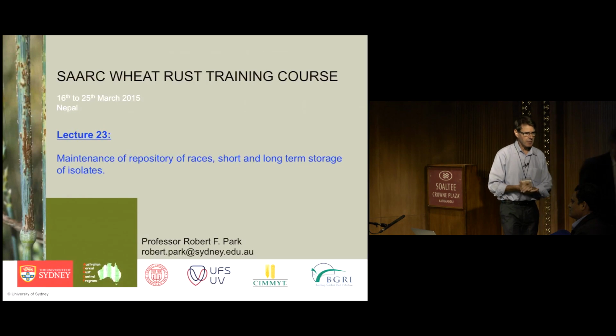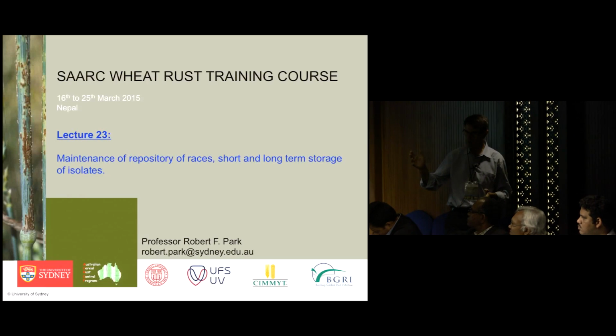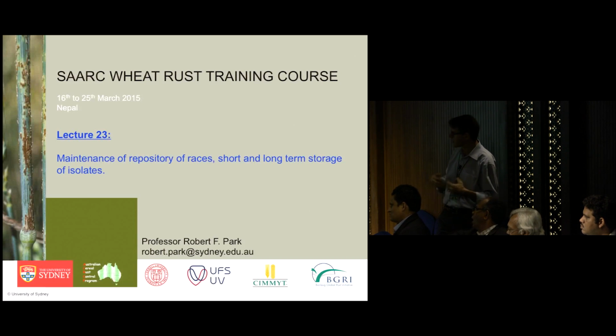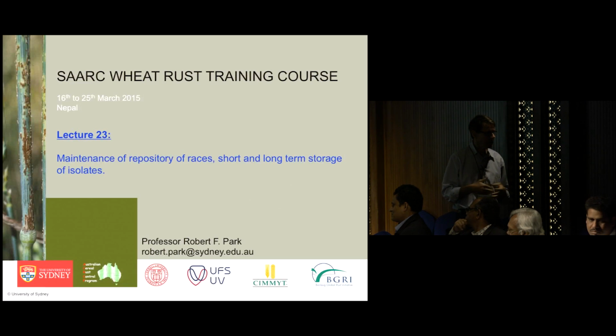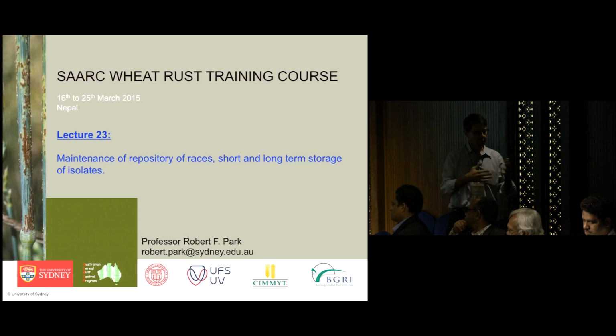Okay, so again, this is a little bit of repetition on the methodology. You saw it yesterday. Zach's given a very good outline this morning on infrastructure and everything else. So this is just, I guess, my take on working with rusts and maintaining a repository of races and storing those isolates. You would have noticed, I think, and this point was made yesterday, that Dr. Sharma's laboratory here in Kumultar does things a bit differently to the way that Zach does it in his lab, to the way I do it, the way probably Java does it and anyone else that's working on Rust.